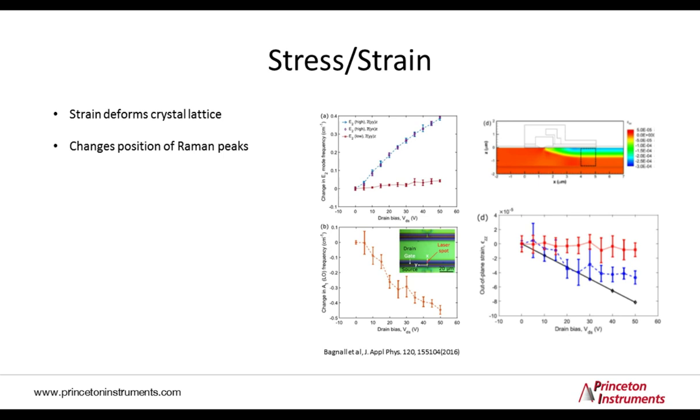So in the figure here, it looks complex, but it simply shows a measurement on a microscopic transistor that exhibits actually strain when electric fields are applied. So it shows the peak position as function of that electric field, and on the bottom right, that information has then eventually been converted using a model to the measurement of characteristic strain in the material.